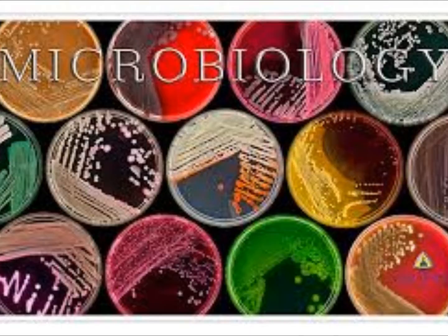Another characteristic that's really not discussed on here is the smell of an organism. Pseudomonas has a grape-like odor. So when you open up a plate and you get a whiff of that grape-like odor, definitely notate that, because again, that's a characteristic that gives you a whole big picture.